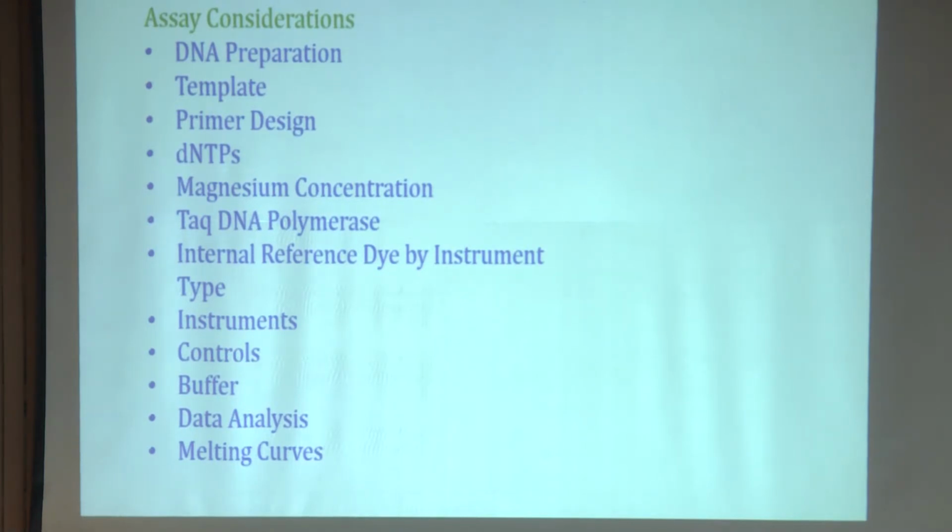Well, and then if you prepare the DNA, you again go for quantification. I will start with the sample which you are using for preparing the DNA itself. Weigh that sample quantitatively, and then you use the same quantity of material for preparing the DNA. Start from there. That is the material you have to begin with for qPCR. And then quantify the DNA.